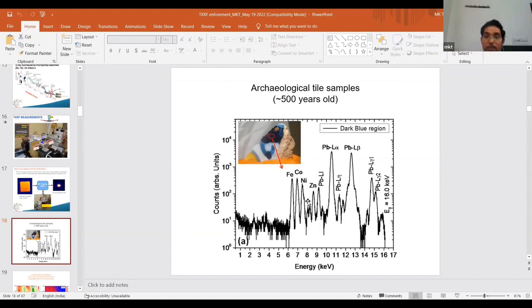The sum peak maybe is there. Maybe the iron sum peak is not overlapped to this. You see the iron K alpha. Yeah, and the iron sum peak is twice, maybe 12 keV. So it's about the Pb L beta. Yeah, it will come over here. You're right. Yeah.